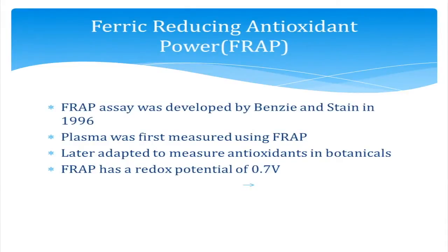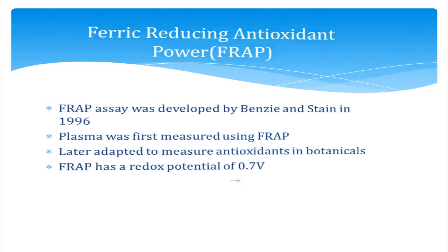Now talking about the FRAP. FRAP is an electron transfer based assay which was developed by Benzie and Strain in 1996. They first measured the plasma and later it was adapted to measure antioxidants in botanicals. It has a redox potential of 0.7.